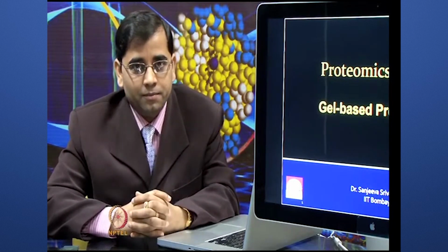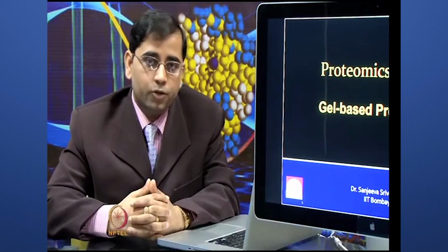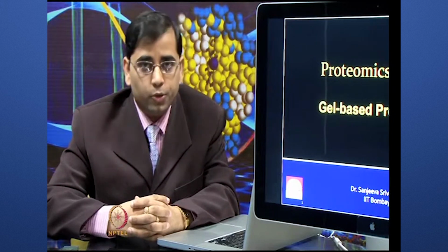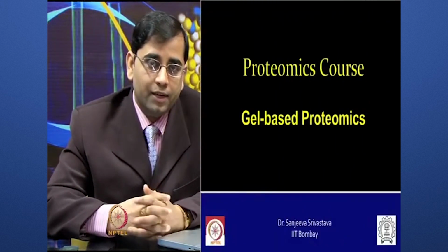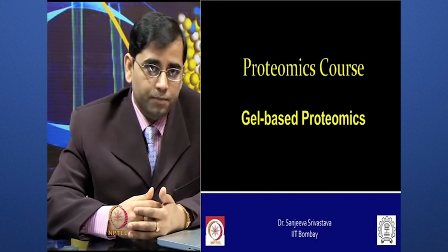day-to-day research. So, gel-based proteomics includes different types of techniques such as sodium dodecyl sulfate polyacrylamide gel electrophoresis or SDS-PAGE, two-dimensional gel electrophoresis or 2DE, the advanced form of two-dimensional gel electrophoresis also known as difference in gel electrophoresis or DIGE. Then there are several advancements and variations of it such as blue native PAGE or BN-PAGE.